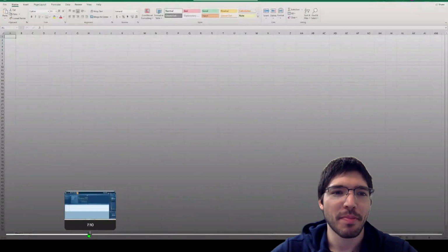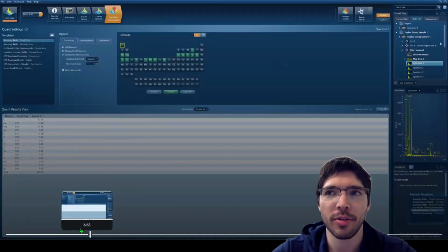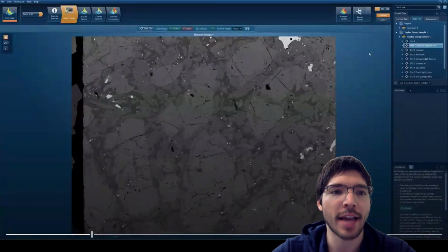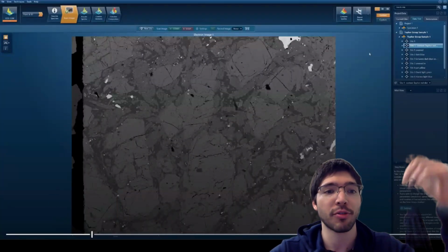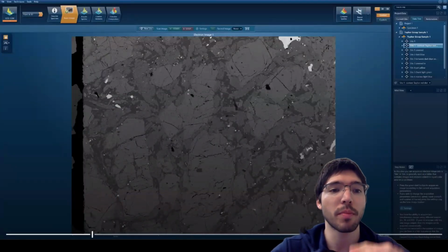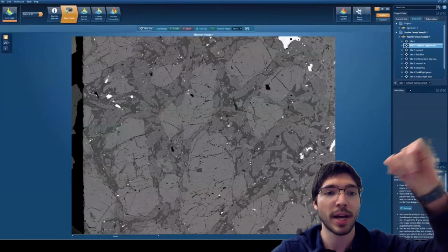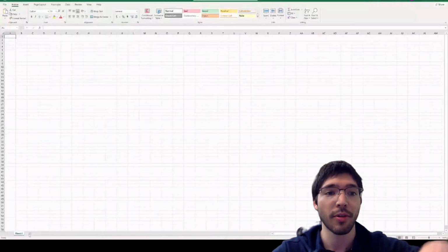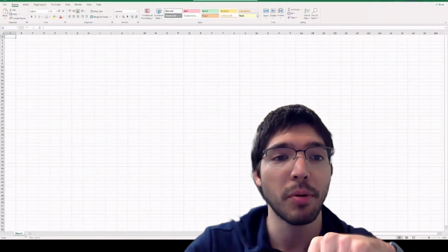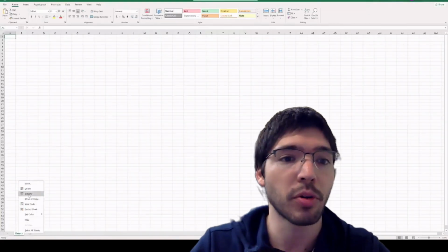Energy dispersive spectroscopy. It's a very valuable technique where you're essentially looking at X-rays that are picked up from atoms in your sample as electrons from what we call the primary electron beam interact with it. This is generated in the scanning electron microscope by an electron source. Those electrons are fired down a column and accelerated, and when they hit your sample, they interact with atoms in it, and you form all kinds of particles and interactions.